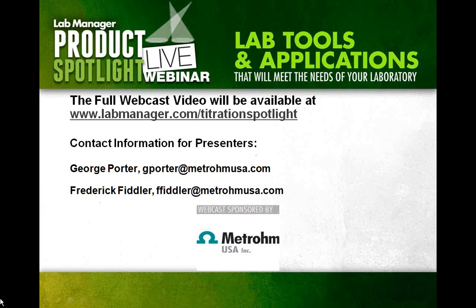Additionally, when we're working with different materials, we try to choose ones that are robust for different cleaning types. If you're working with something like crude oil or different polymer resins that are very difficult to clean, we like to use materials that will be easier for you to clean. They are very easy to clean, and there aren't a lot of small spaces, nooks and crannies, to get your reagents or sample into, because that would impede the efficiency of your titration if you have a lot of places where things can deposit.